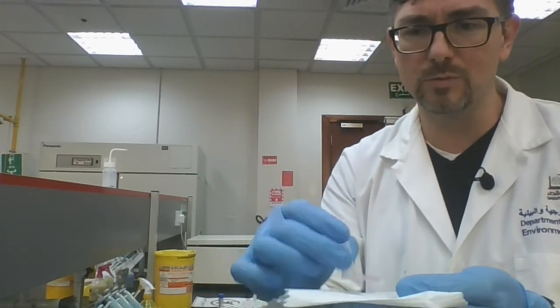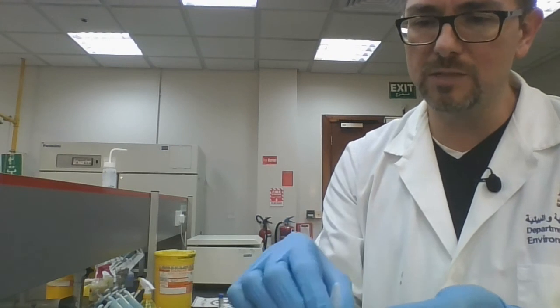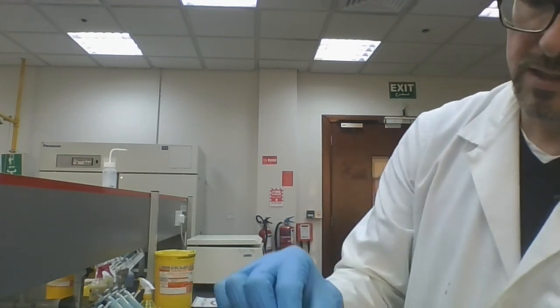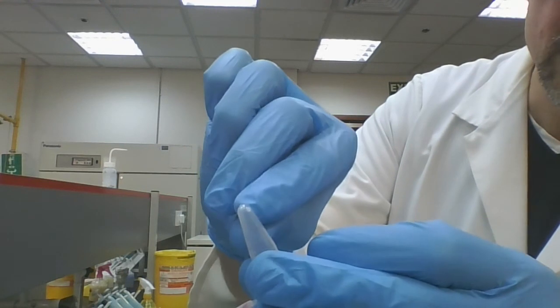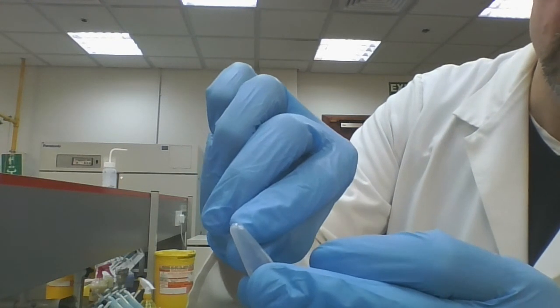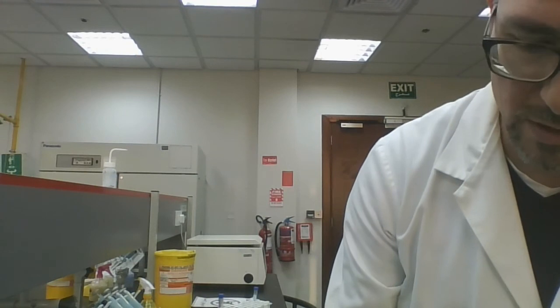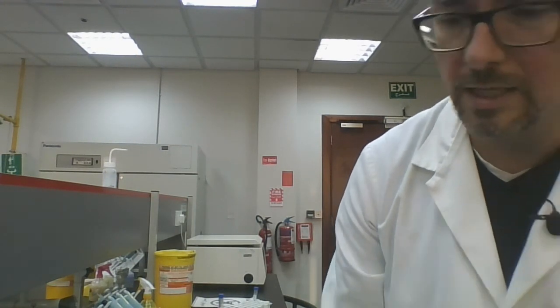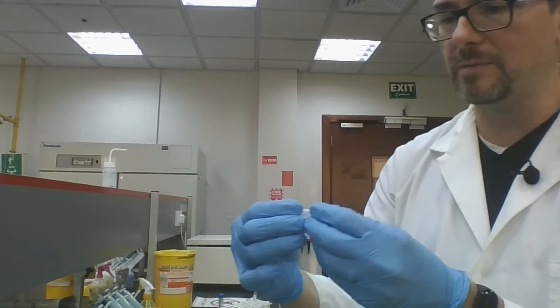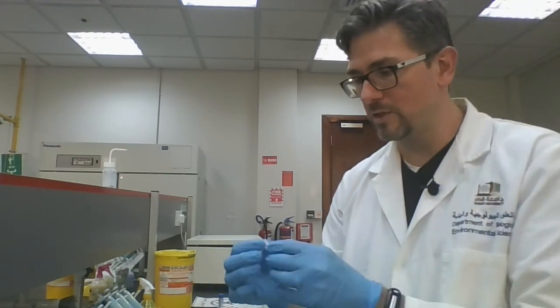So we're inverting the tube over a paper towel, tapping it out. But just tap it gently, because in this case, at least here, the pellet has actually moved over. So it has become loose, and it's on the side of the tube here. That's the pellet. It's still visible. But we want to remove as much liquid as possible, because if you have any ethanol still left in your pellet before you dissolve it in TE, that's potentially going to interfere with enzymatic reactions. It's going to affect your final product in the end. So make sure that you have a dry pellet.